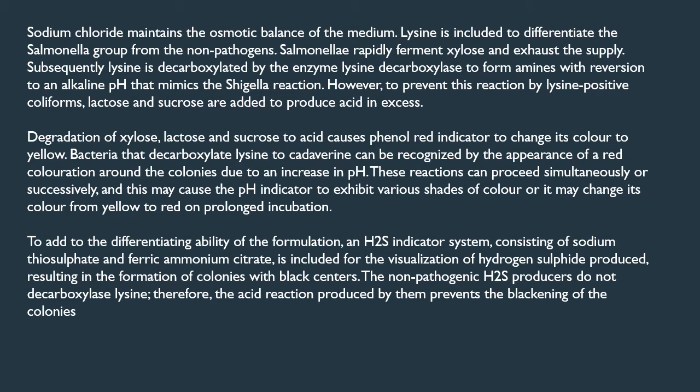This reaction can proceed simultaneously or successively, and this may cause pH indicators to exhibit various shades of color during the incubation. So that can be from yellow to red on prolonged incubation, right?